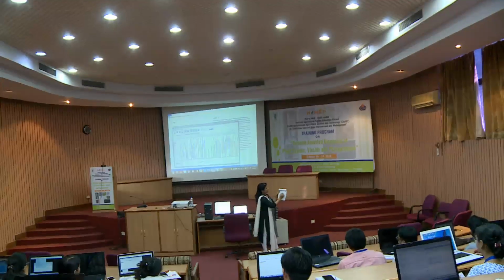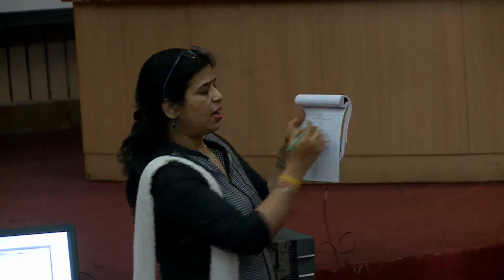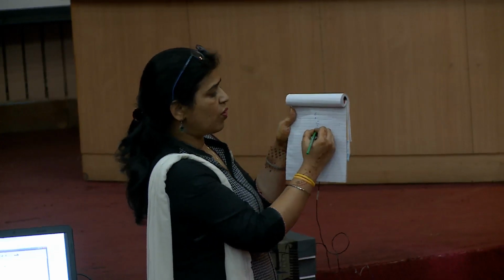Here it is reading C, but here, since the reaction is dying out towards the end and the resolution is not proper, the quality is not proper, the software has read it as A. BioEdit will read it as C or A. That also depends: if you use licensed software, it will more reliably give you the correct base, but if you are using some online software, then definitely some errors will be there that you have to check manually.